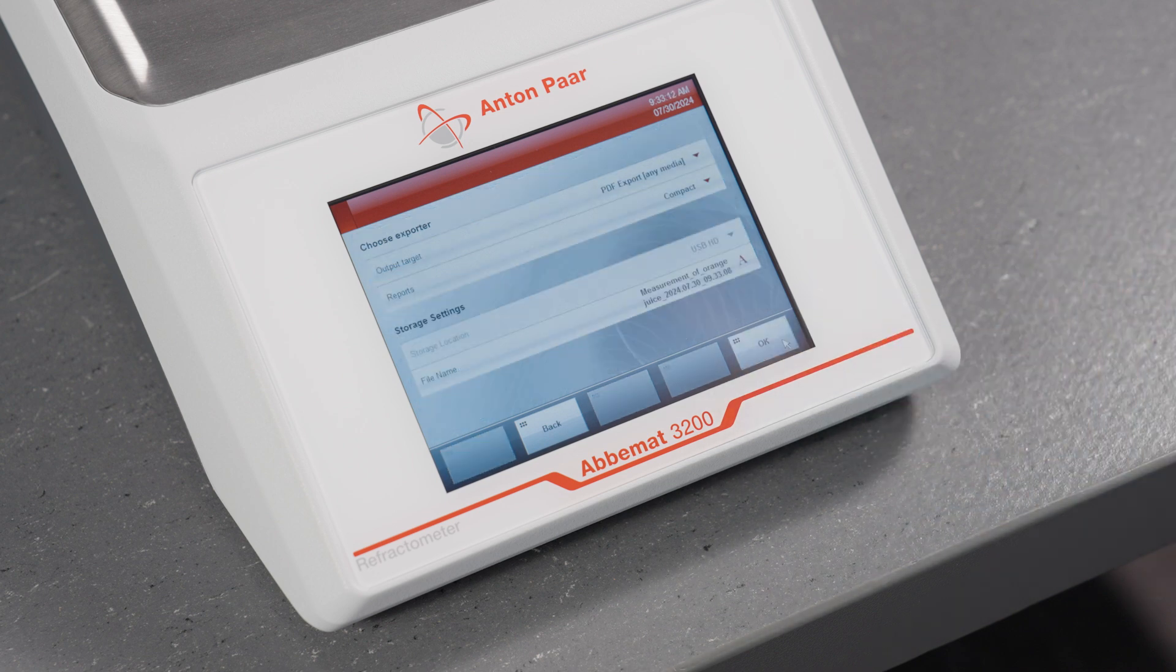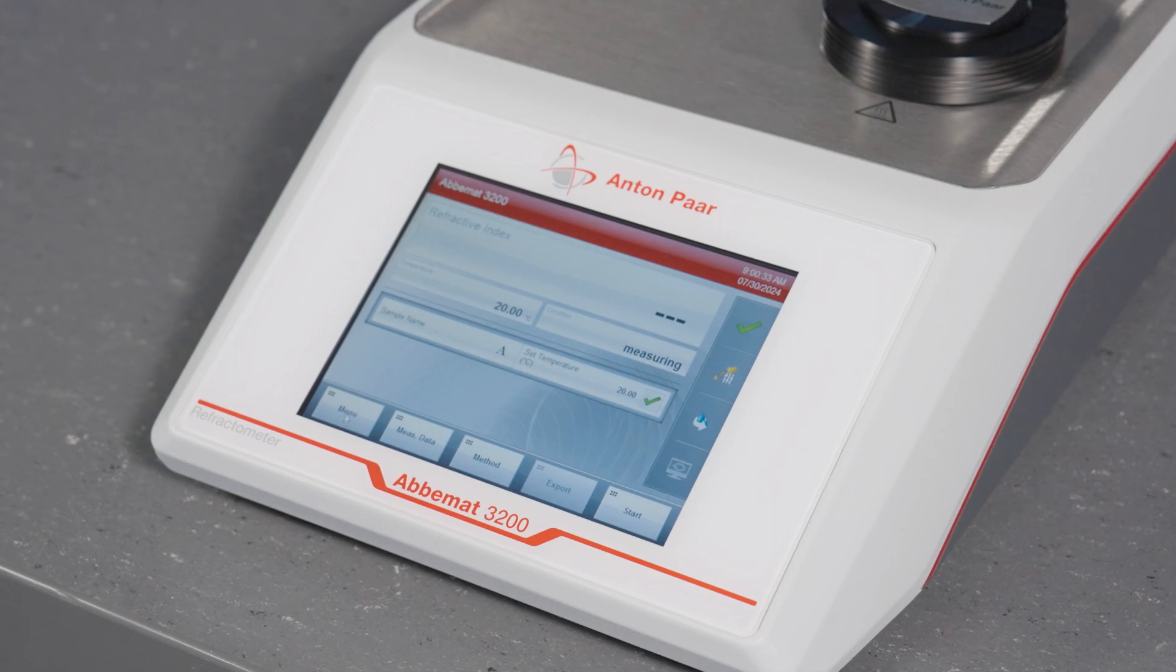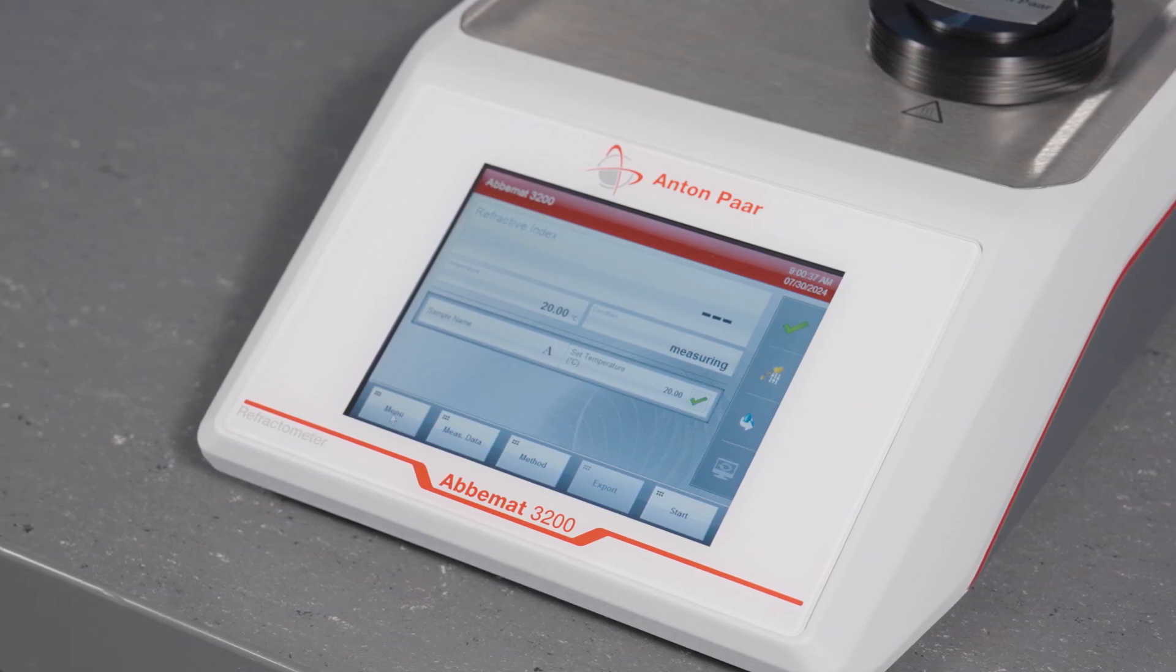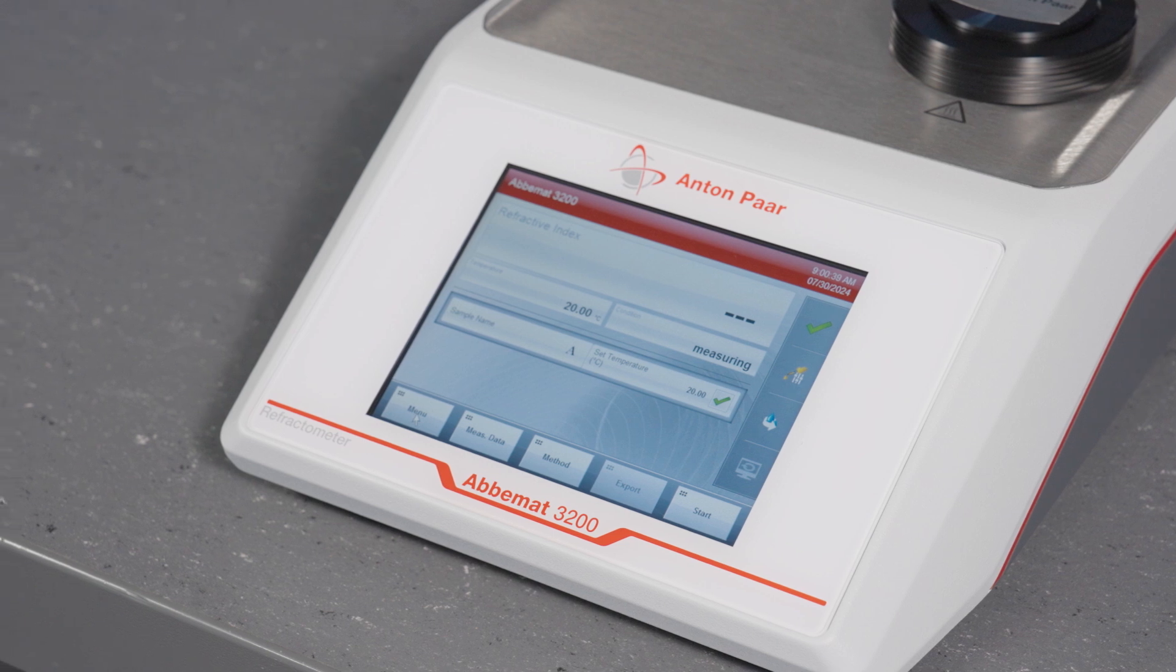With the Abimat 3000, 3100, and 3200, you can rely on precise and reliable results, ensuring the highest quality in your daily laboratory work.